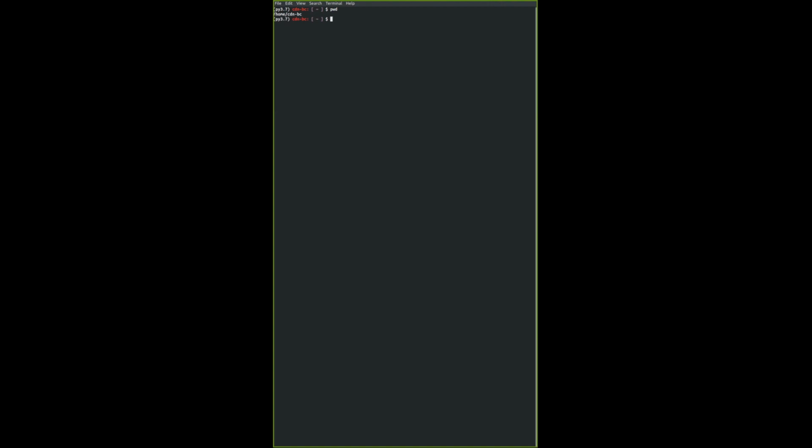We can also change the working directory. We can move to somewhere else in the home directory. Again, the shortcut here, the tilde, is referring to home. We can navigate deeper into the subdirectory by providing the command cd, which is short for change directory. So we can go into here, and now you see that my current directory is now in originals.